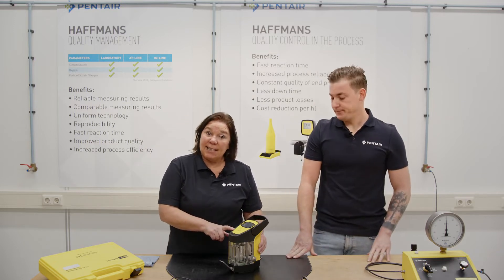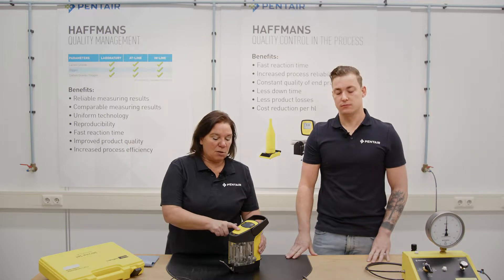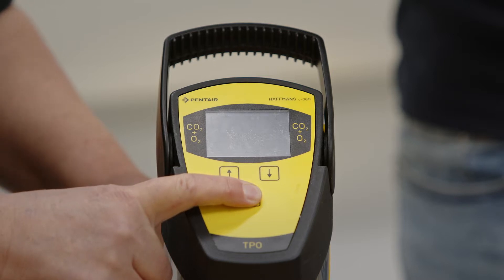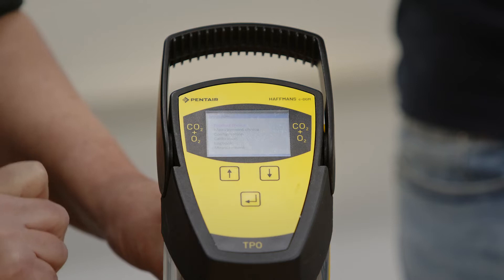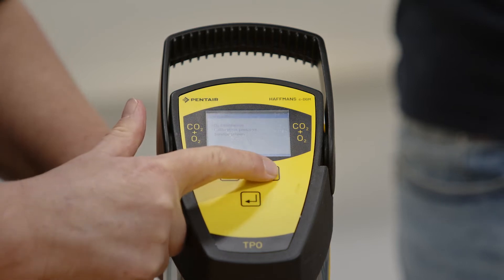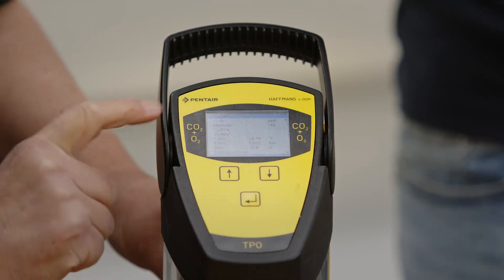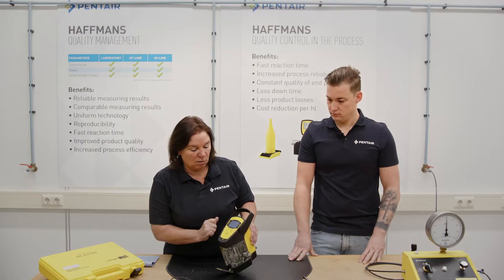For reading the meter's actual values, we switch on the meter by pressing the power button for three seconds and switch once again to get access to the main menu. We scroll down to the calibration menu and further on to the service menu, and there we read the actual values.